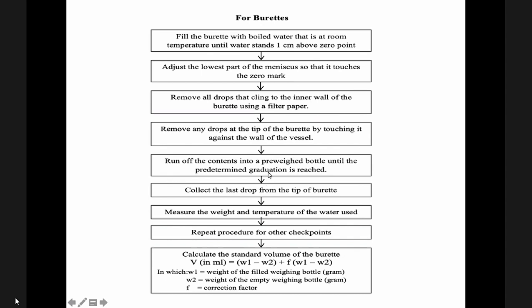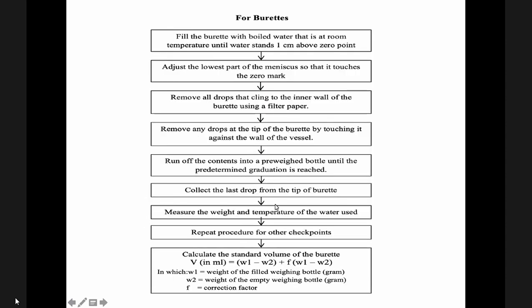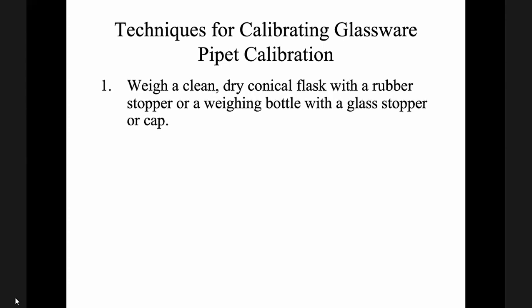Entire volume na transfer na. Then collect the last drop from the tip of the burette and you measure the weight of the liquid, no, na halin sa burette and also the temperature of the water. So repeat procedure for at least 3 times. Pero ang kaginaya for pipettes, 4 times. So the more, the better. Next, calculate again using this formula equation.